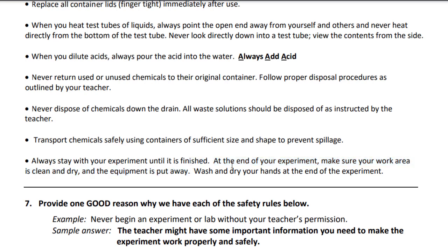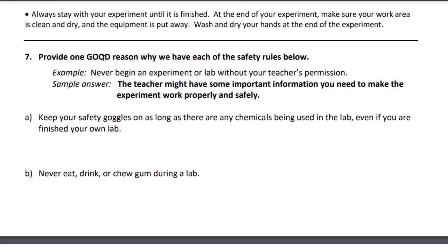And then you make sure that you have washed your hands, especially during COVID time when you guys might be touching the same beakers and whatnot. You want to make sure that you're keeping your hygiene really good. So you want to dry your hands at the end of every single experiment. And we have soap here in the lab to do that. So let's go through then one good reason why we have each of these safety rules here.